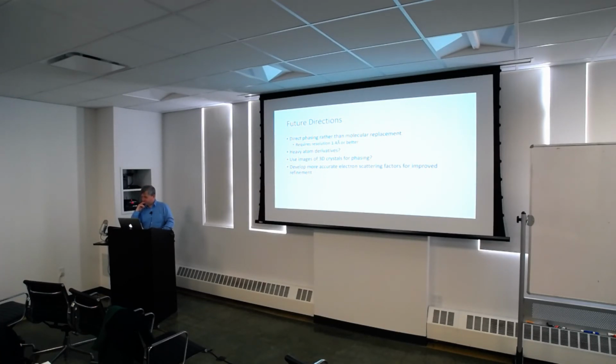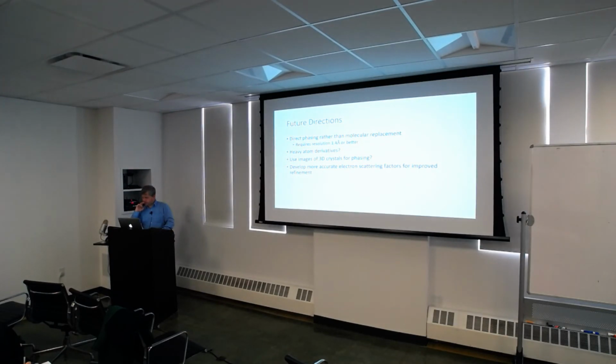I'm not a particle physicist obviously, but energy should be factored in to some degree, but it's the nature of the particle creating the collisions that produces the anomalous diffraction. That's why it's uncertain whether electrons can actually do it. X-rays can accomplish that efficiently, depending on the heavy metal you're using, but it's not the same thing.